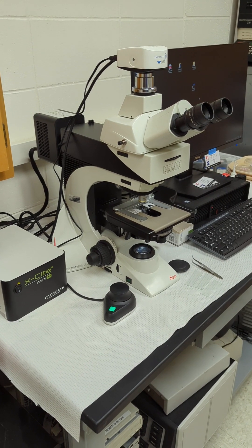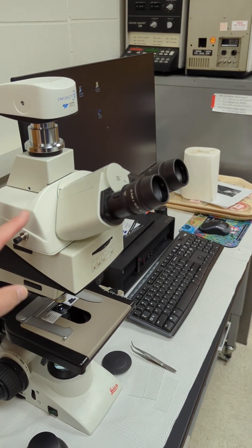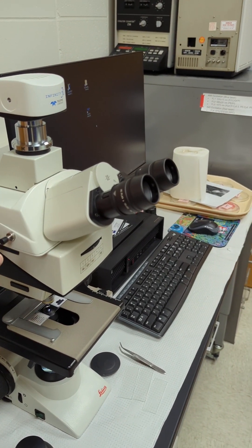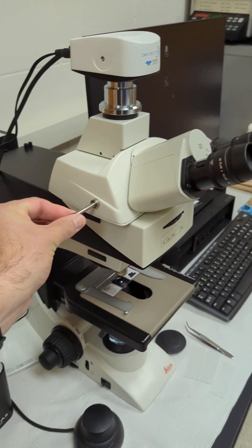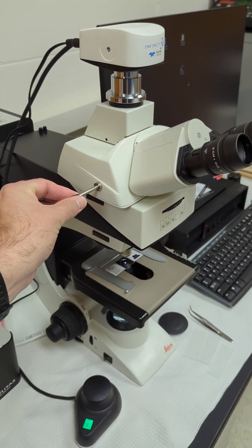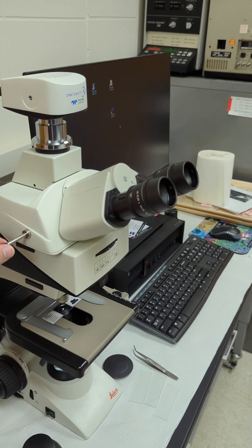Starting from the top, we've got our camera, your eye tube, and this plunger here with your eyepieces.